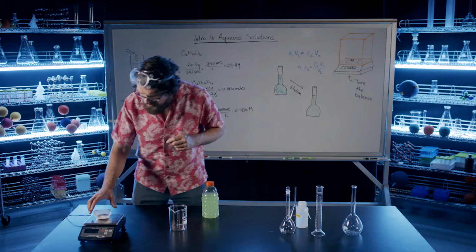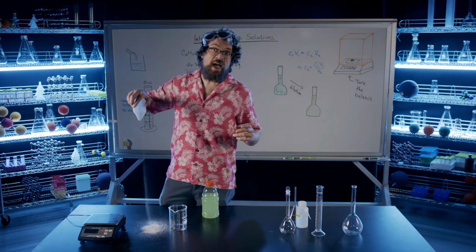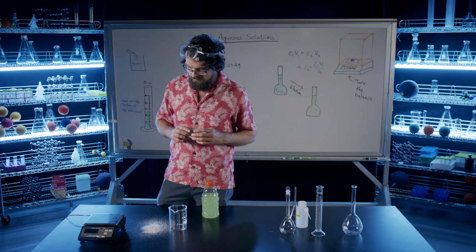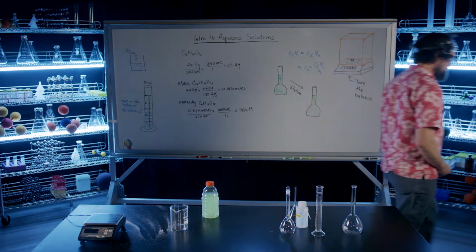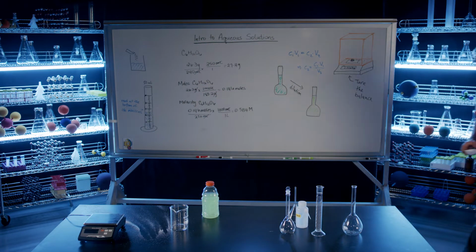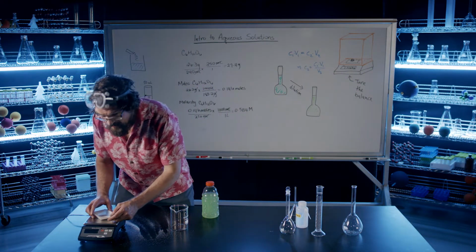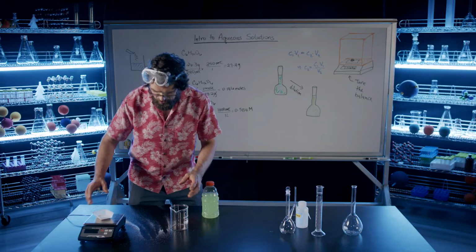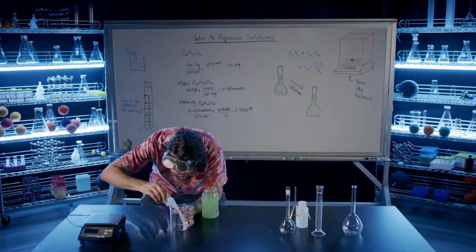Now, it's important to add this solid in a way that's very quantitative. 27.4 grams of dextrose that I will now add extremely quantitatively.